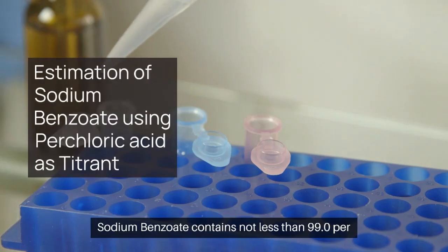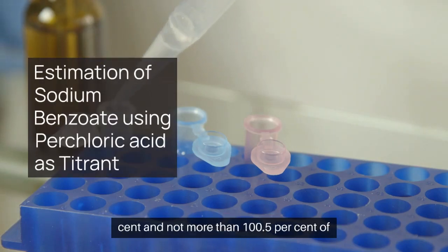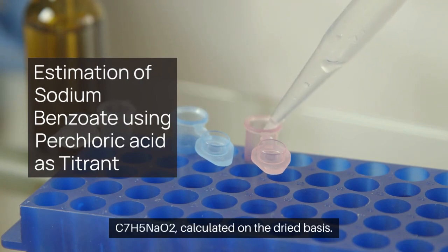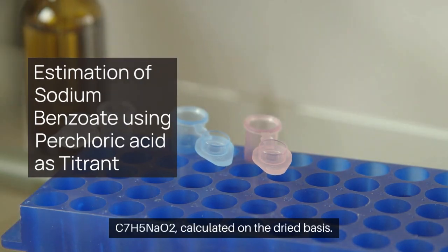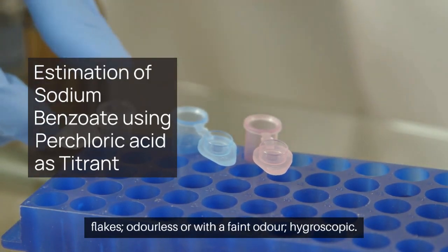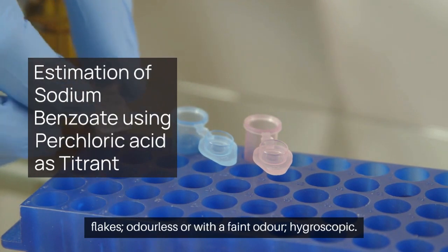Sodium benzoate contains not less than 99.0% and not more than 100.5% of C7H5NaO2, calculated on the dried basis. Description: a white crystalline or granular powder or flakes, odorless or with a faint odor, hygroscopic.